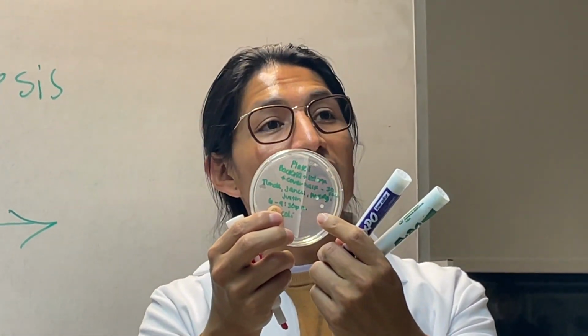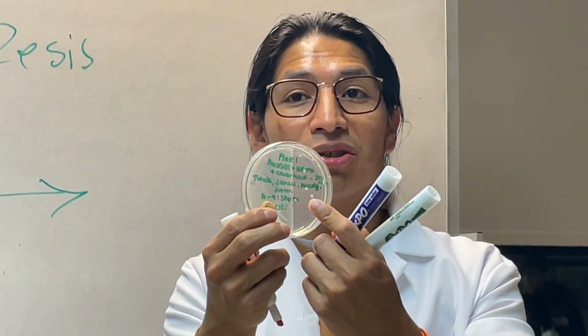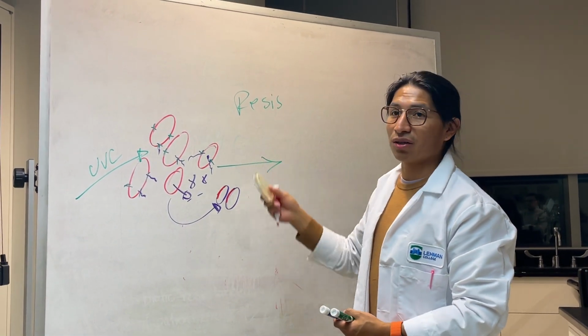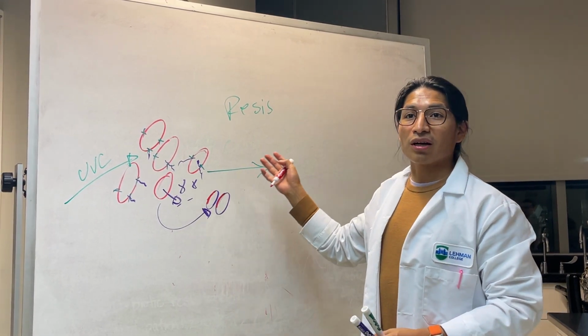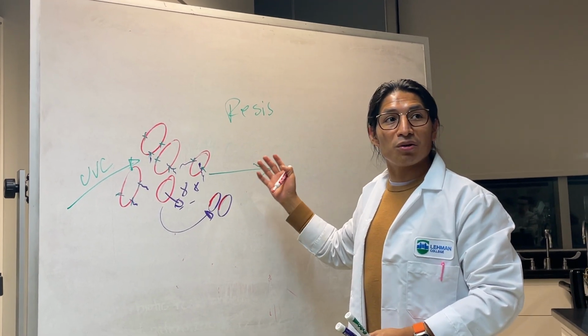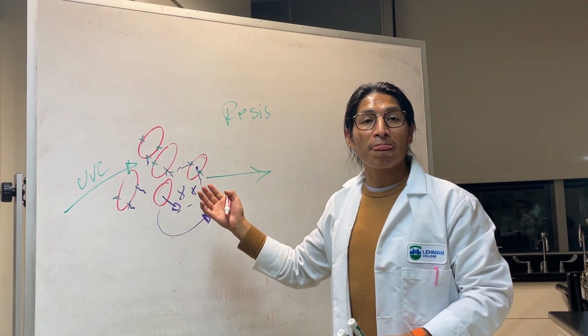We can see these colonies because they have been growing for 7 days under normal conditions and are still in there. So this is what we can consider. You can consider this conjugation. You can also say transformation, horizontal transfer. Any of those you can use, but you need to select one of them that makes more sense.